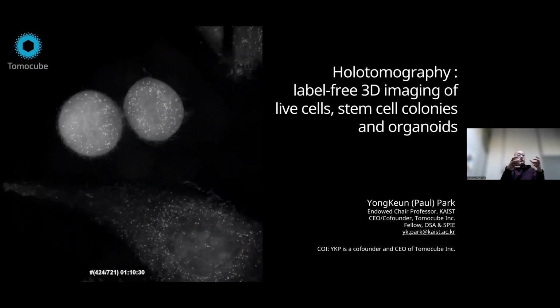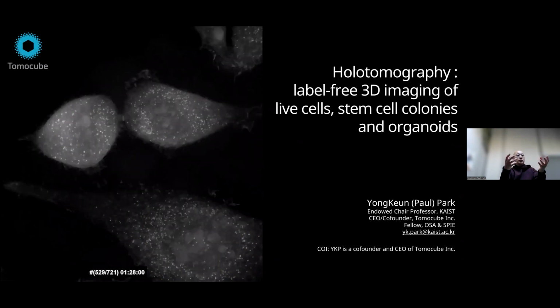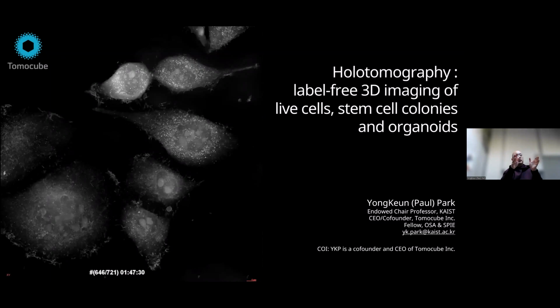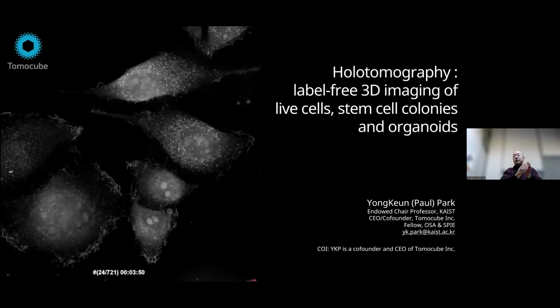For example, you're watching mitosis of a cancer cell line, with chromosome condensation and separation, and all this jiggling of spots corresponds to lipid droplets. You can beautifully see the membranes and also the major subcellular organelles.